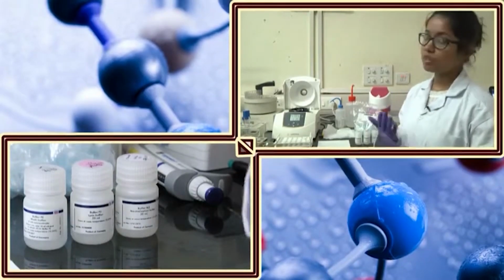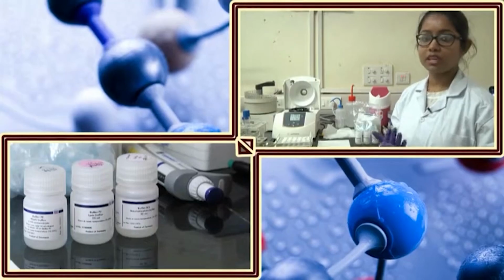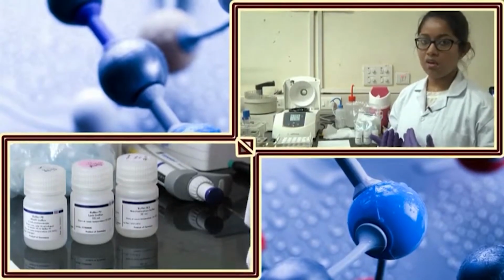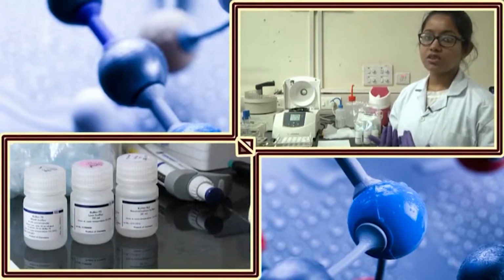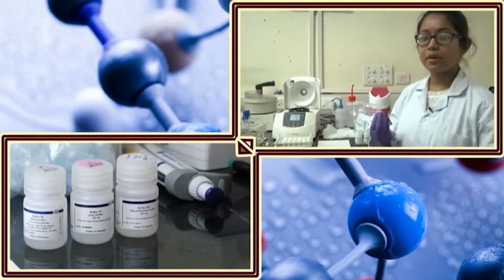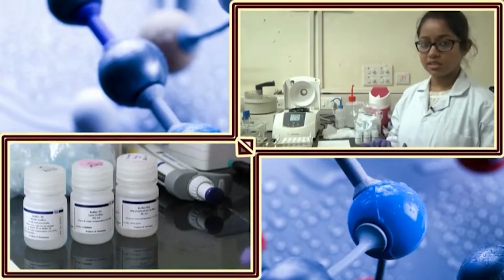And immediately after putting in the neutralization buffer, we will centrifuge the whole solution, so that the other substances precipitate out. The plasmid DNA, which is covalently closed and can readily anneal after we give the potassium acetate, will be kept in the solution and we will isolate the solution.